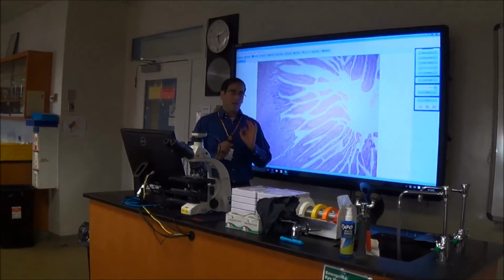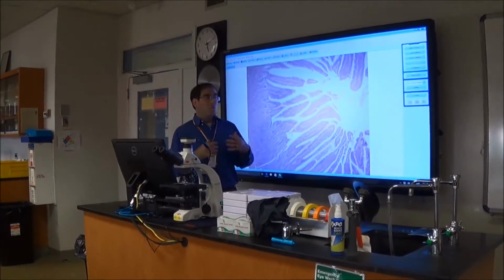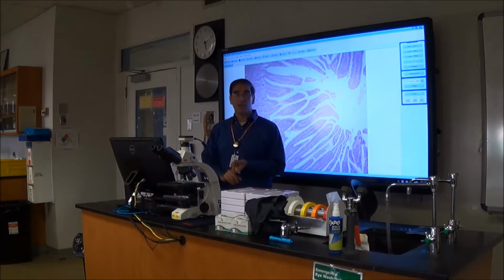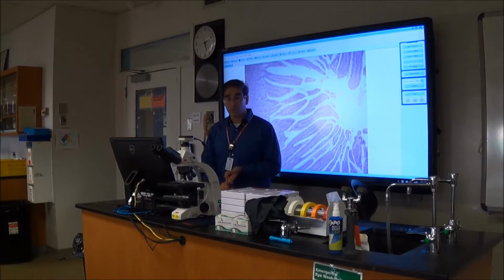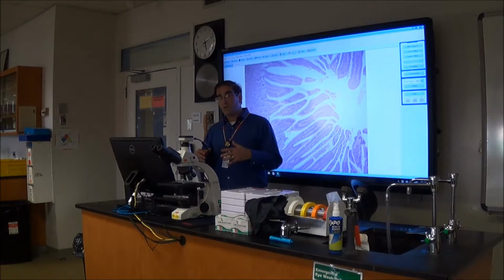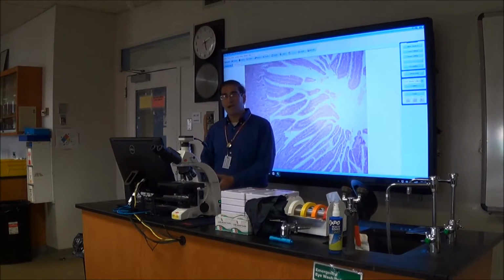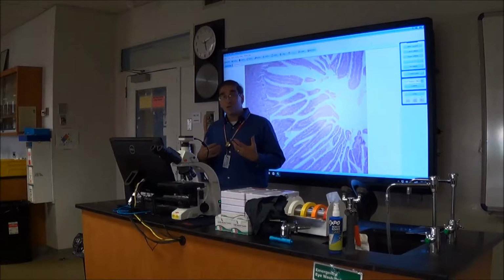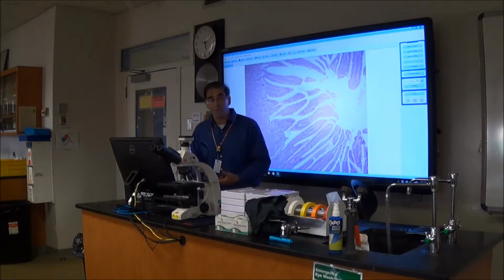Now, while all of this is great, what if you don't have a slide? What if, for instance, on your Moodle site, you've got an image that you really like, or on the internet you find an image that you really like? Well, you can send that out as well. So, for instance, one of the things that we notice is that students often want something for comparison. They're not sure what they're looking for. We've actually seen students that will take out their cell phone and they'll have it on the desk and they'll be sitting there looking from microscope to cell phone. Well, you're basically going to be doing the equivalent for them.